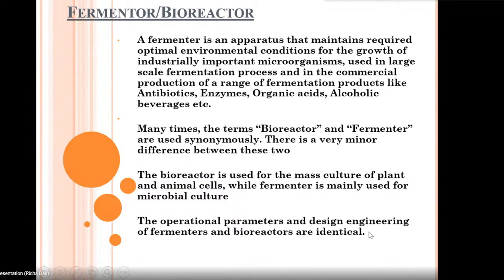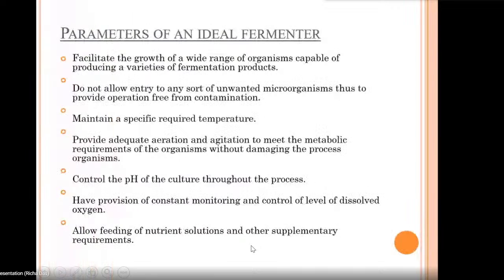So these points I have already discussed just now, that they are used synonymously. There is a minor difference between them. What is the minor difference? That also I have said. And as I said, the operational parameters, the way they operate and the way they are designed, are the same. Now we will see what are the parameters of an ideal fermenter.